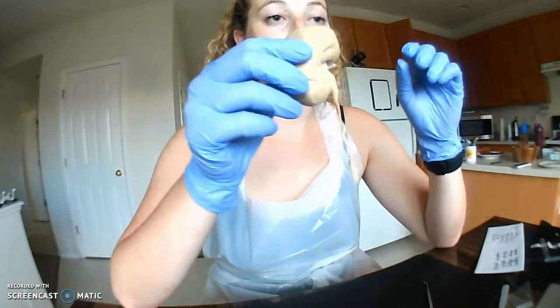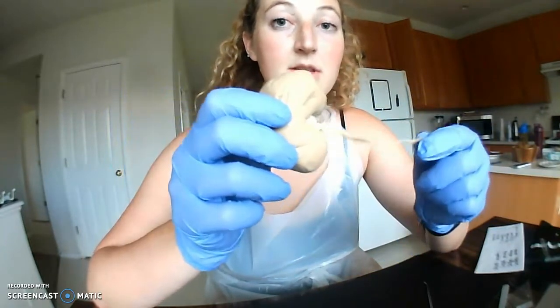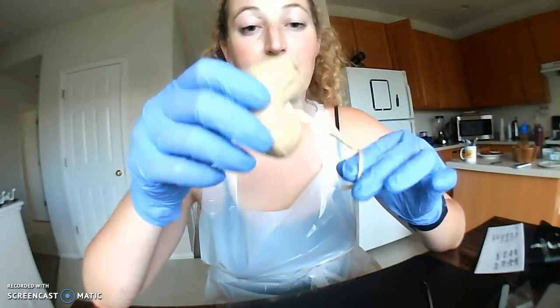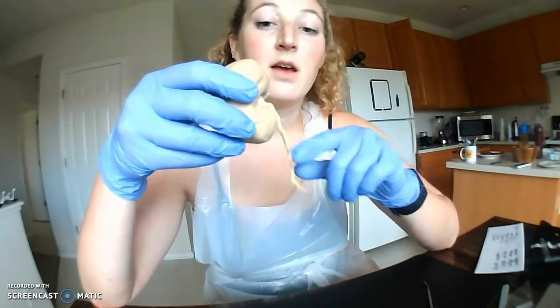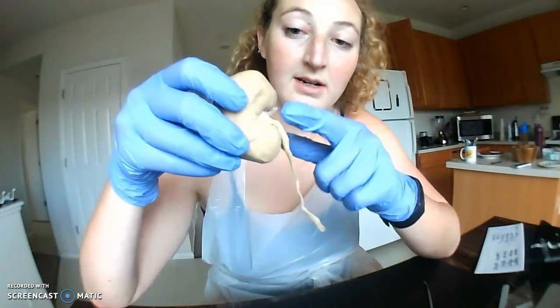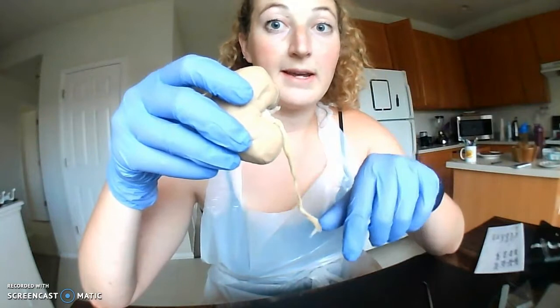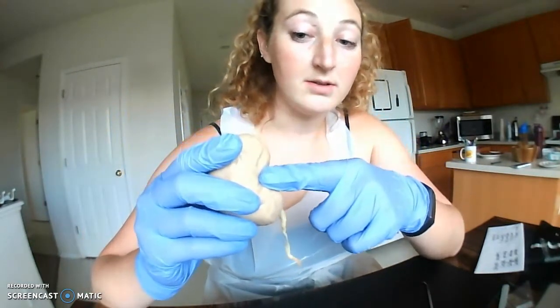So here is my dissected kidney. You can see hanging down here, this is the ureter, so that'll be the tube that takes out all of the filtered waste from the kidney, brings it down to the bladder to be excreted. You can see it connects to the kidney in this little concave section here. You can see that's also where the renal artery and the renal vein attach. So this section is called the renal hilum.